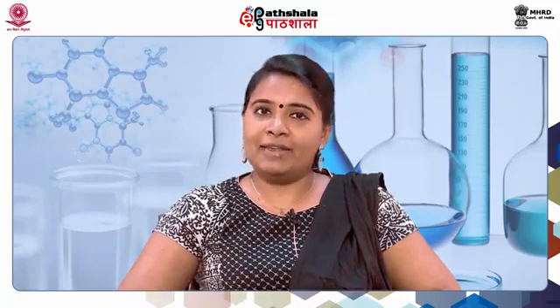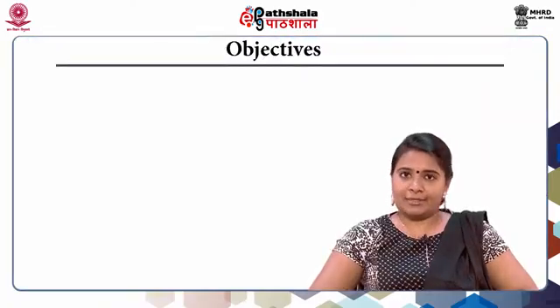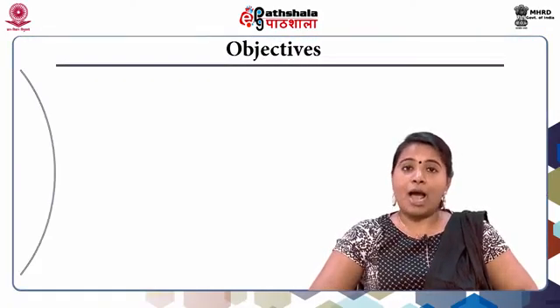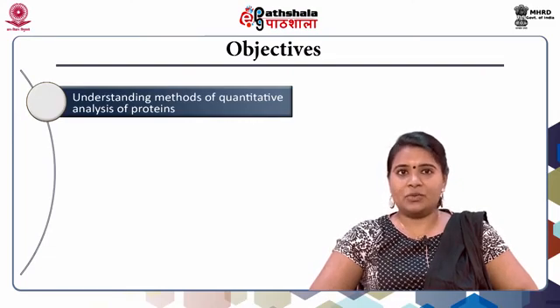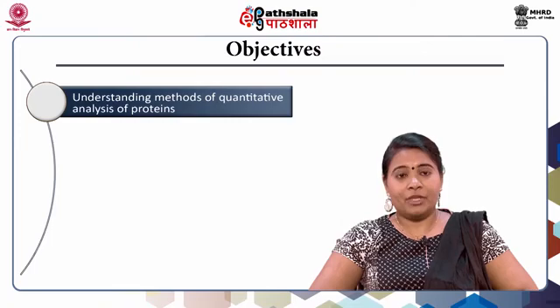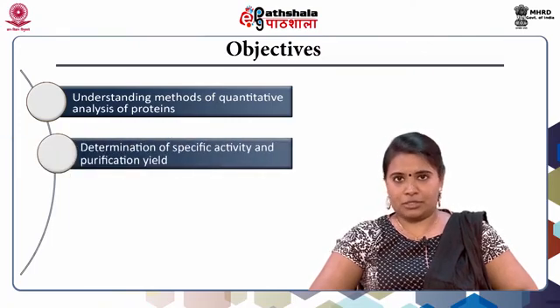I am going to talk today about a very relevant topic, purification of enzyme part 3, from the paper Protein Biochemistry and Enzymology. In today's lecture, we will focus on understanding the methods for qualitative and quantitative estimation of protein, which are essential during each step of a protein purification process.